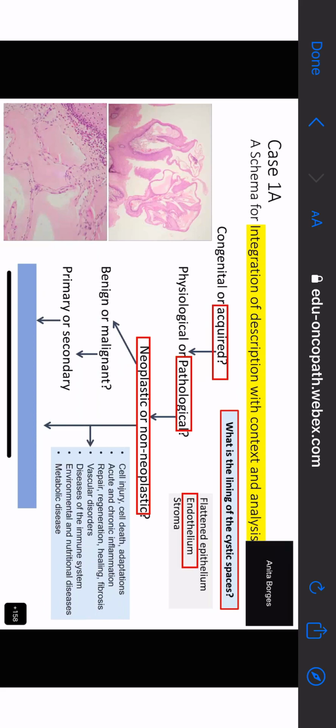Have you ever seen a person who has had extensive dissection of the lymphatics, or for that matter, has lymphatic obstruction by filariasis, etc.? Can you get dilated lymphatics? Yes, ma'am. Right. So Sweta is right. She's very uncertain as to whether this is neoplastic or non-neoplastic.